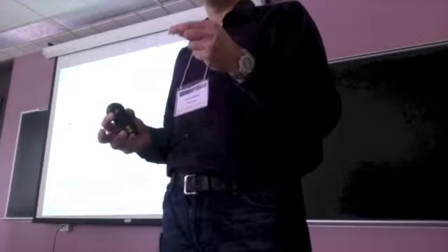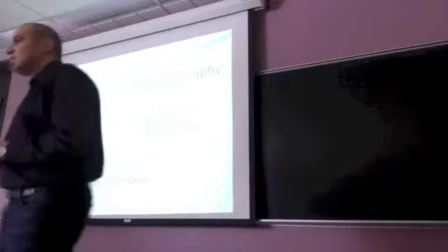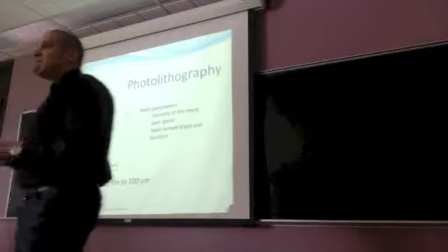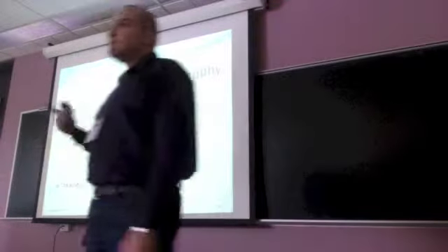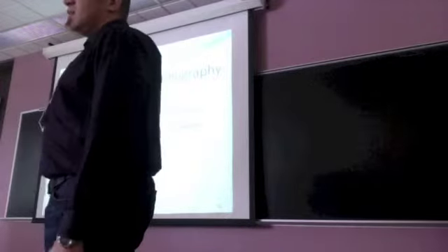Is this optical lithography or also e-beam lithography as well? I will talk about e-beam lithography. But this is optical. But for spin coating, you use also e-beam. You can spin coat e-beam lithography resist. At this point, it's the same.